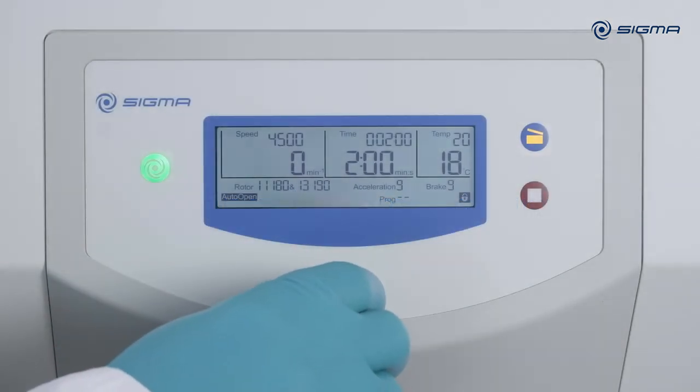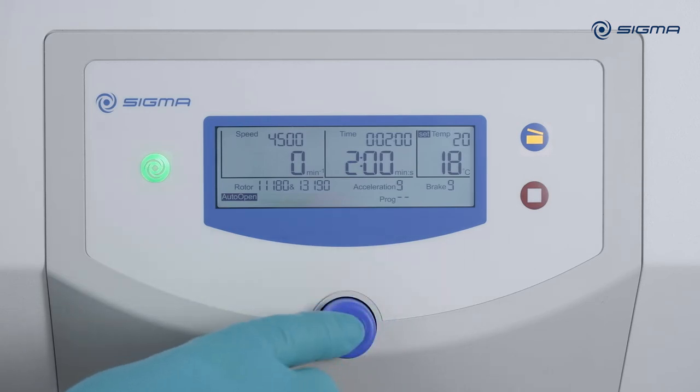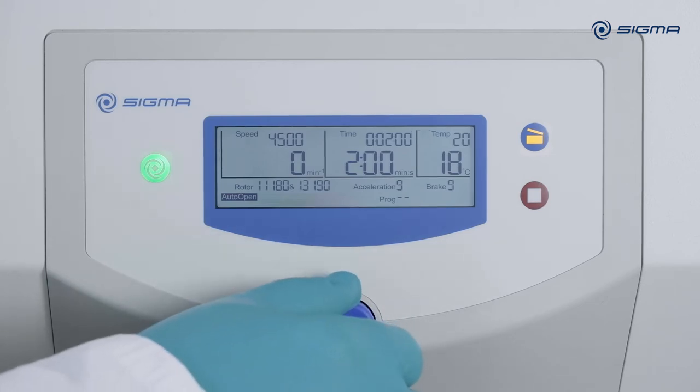To change the temperature, turn the knob five clicks to the right. Press the knob and select a different value, then press the knob again to accept the new value.